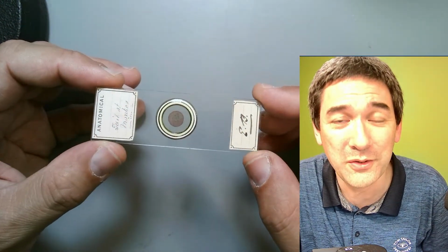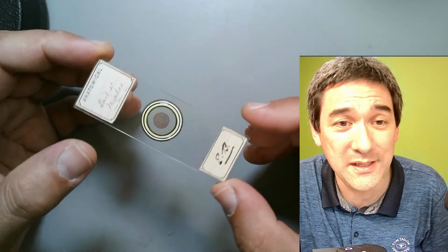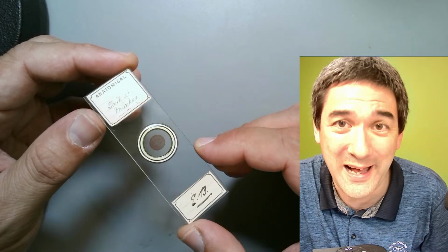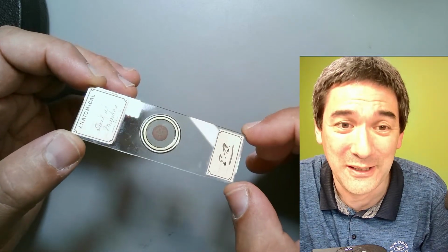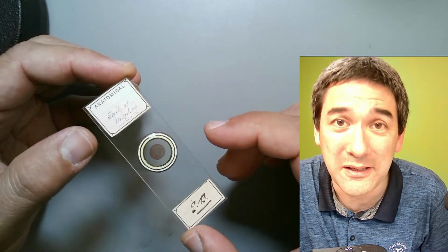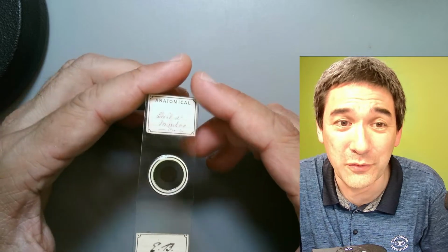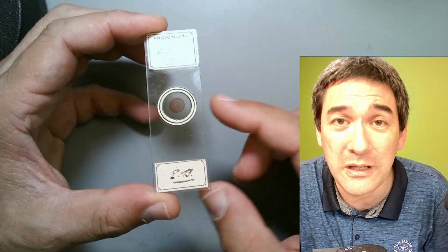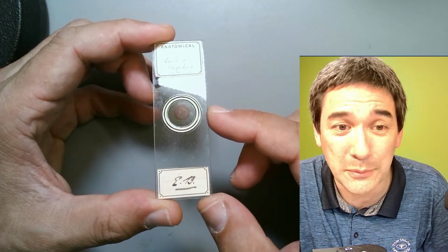And I just wanted to advertise again one of my older videos. This is an antique microscope slide, and it's one of the most expensive ones that I have. I think I paid over 30 euros for this one slide here. It's around 100 years old. And it is the tail of a monkey. And I really like this slide. I use it also because it's very educational, because it shows so many different types of tissues. And it's really well prepared.